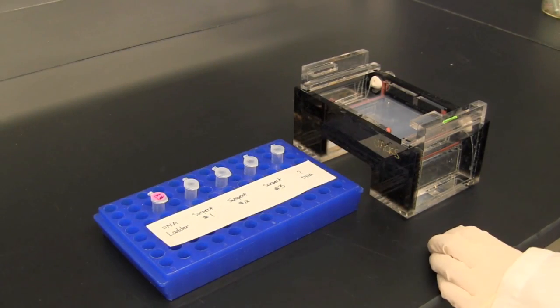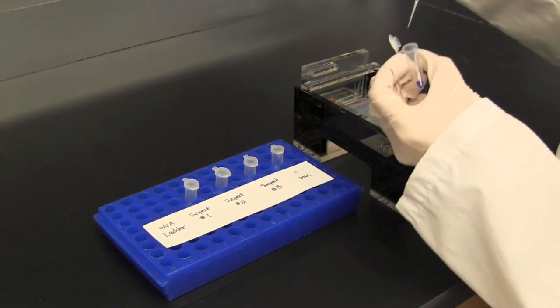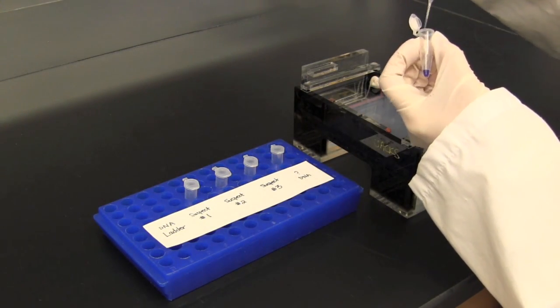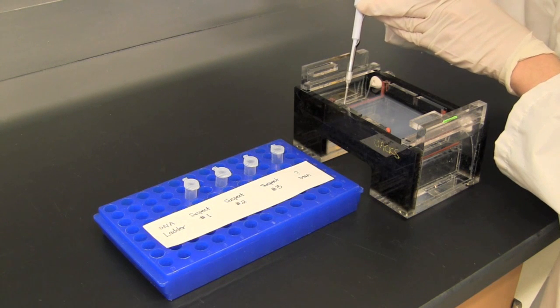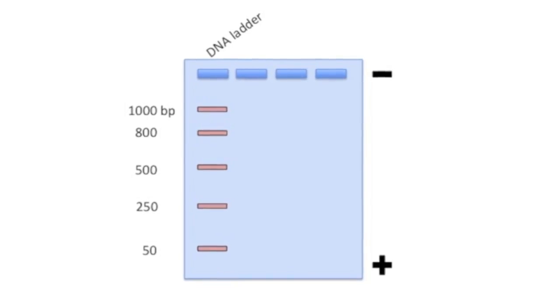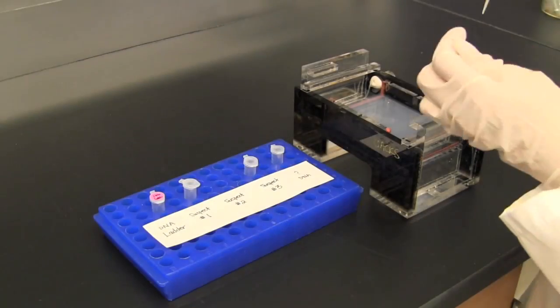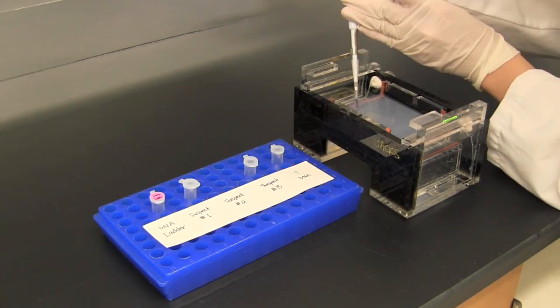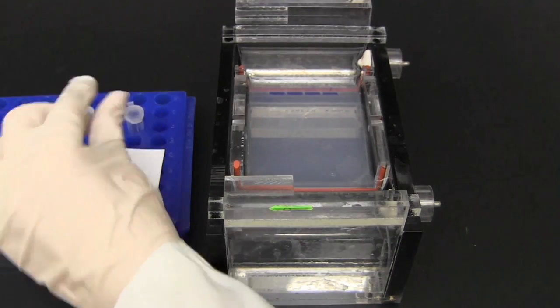Before we load the samples into the wells of the gel, we need to load a ladder in the first lane. The ladder is a mixture of different DNA fragments used as a standard of reference to determine the sizes of unknown fragments. The unit of measurement used to refer to the size of DNA is known as a base pair, or BP for short. Now we can take the DNA from the three suspects, mix each of them with a dye, and load them into the wells next to the ladder. Here is a closer look at how the gel is being loaded.